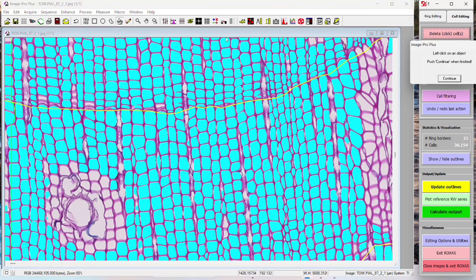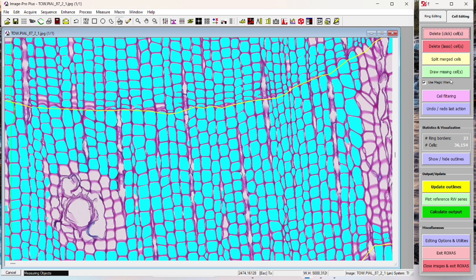And that's it. Usually this is around the time that you are winding down editing an image. All of these steps you don't have to go in the order that the video obviously puts them in. Once you know what you have to do for an image, you have all the tasks in your brain. You don't have to do this in any kind of order, but it's good to do it in an order for a while until you get really used to it and know what you need to get done for each image. But typically I save this one for last, especially after doing the delete lasso cells. I want to do that one first before I do the delete individual cells.